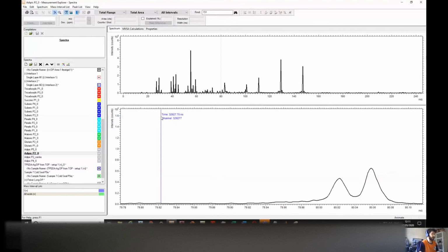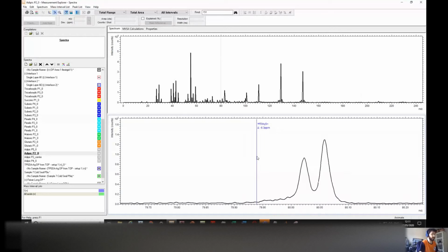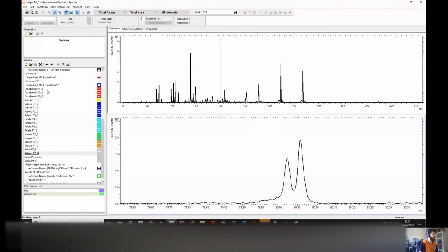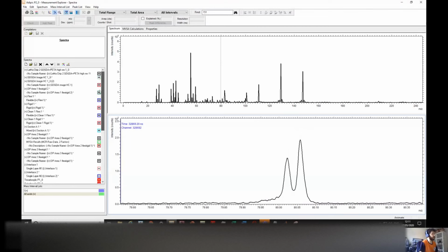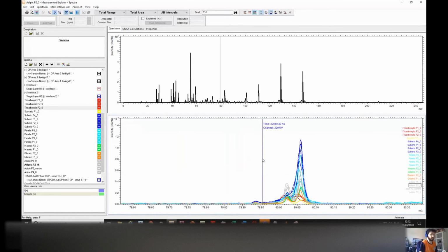So I imagine everyone is familiar with this, but the only thing we have to make sure is, because we're exporting data for several measurements, they have to be consistently calibrated. So the way I do this is I set up an overlay. So I only include the ones I'm interested in the overlay, by, I'm not sure if you know, by pressing V here, so it will kind of fill in with the color. And then I come and make an overlay here in the high resolution view.